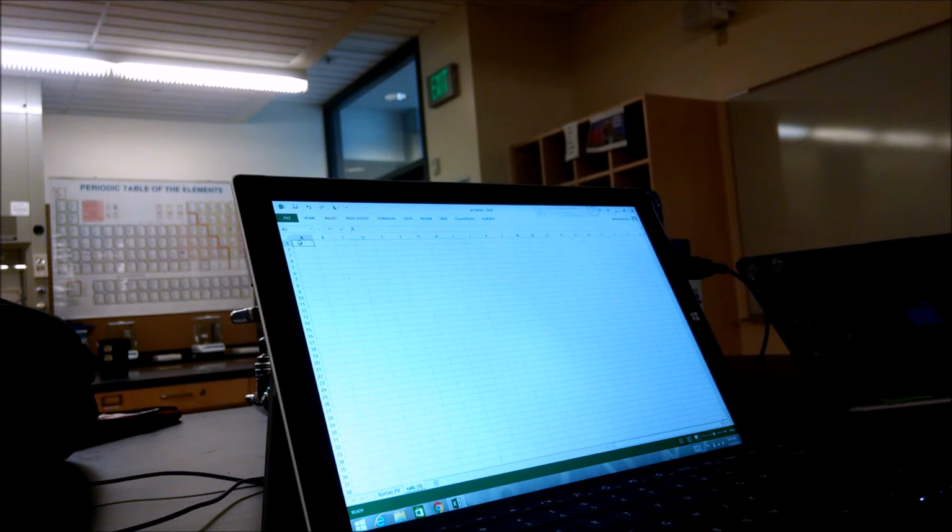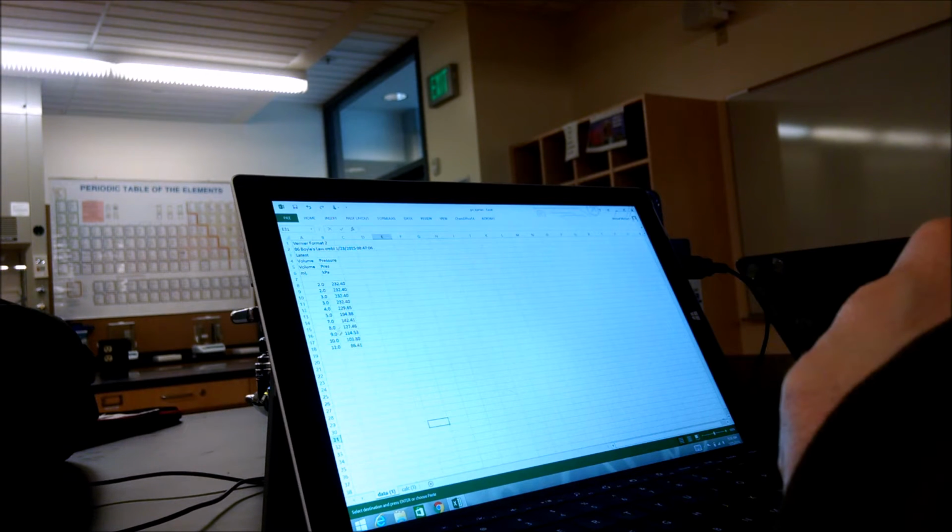Okay, so I'm going to put equals, and my data is this one. Wait, did it tell us earlier to change the name of the sheet from whatever it was to Data? It should have probably. Yeah, so the first one should be Data 1. We were supposed to rename this earlier. Data 1, we got that. Calc 1, and I've got it sorted. Oh, but these precisions aren't right anymore. So these precisions are correct.